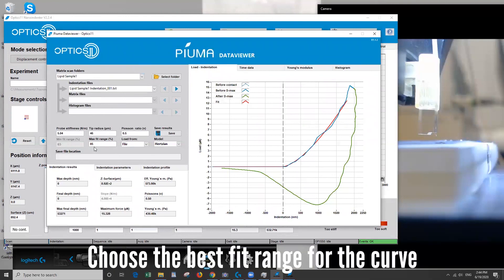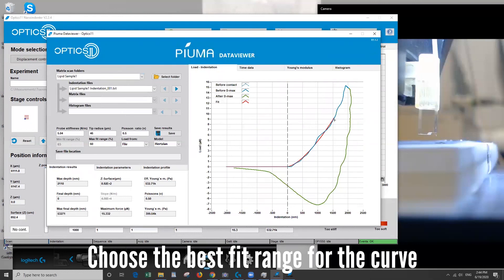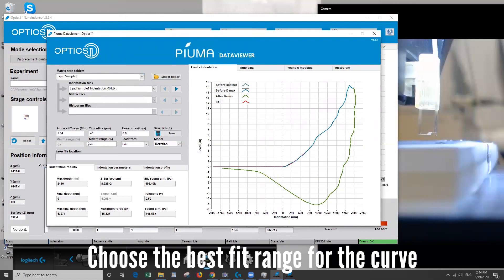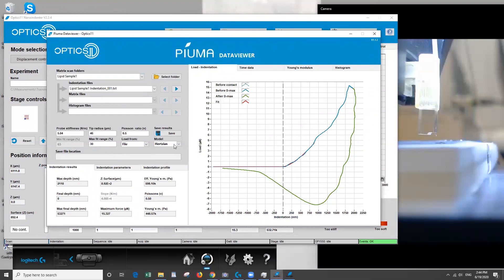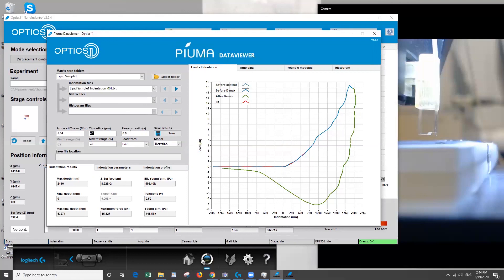The fit of the curve is 85%. We can change that to something smaller, depending on how much of the curve you think needs to be fit. You can see 30 will stop about here. And you can decide which fit looks the best. Make sure you're choosing the Hertz model. And then you can see it's inputting the parameters stored in the software. So if you forgot to do that, definitely fix that here. And then you can see the estimation of your effective Young's modulus here.